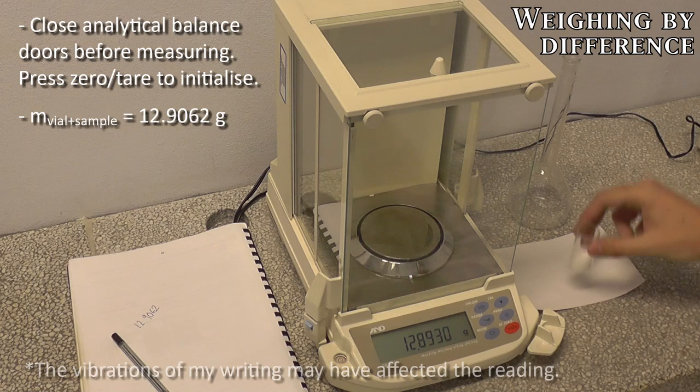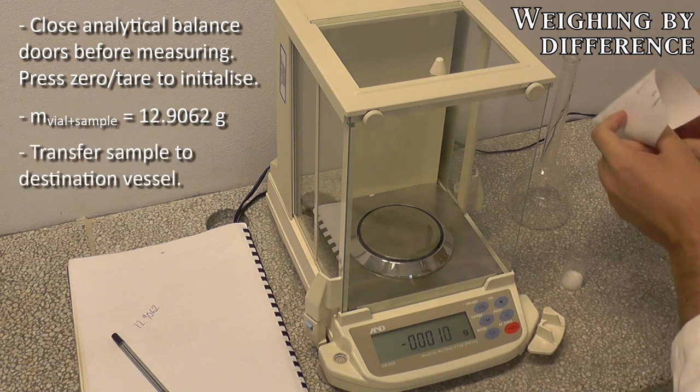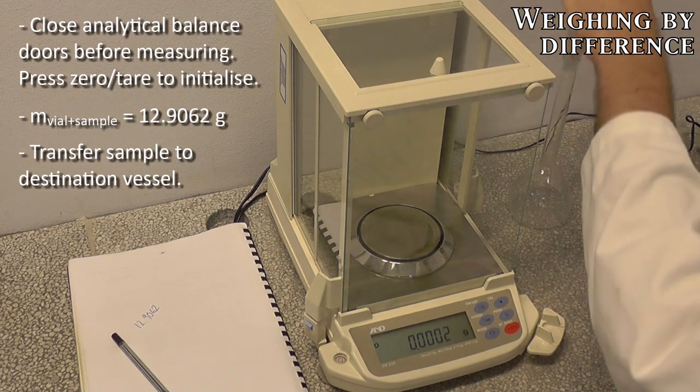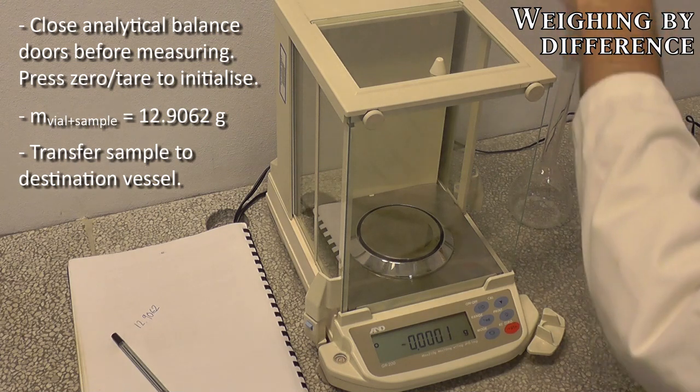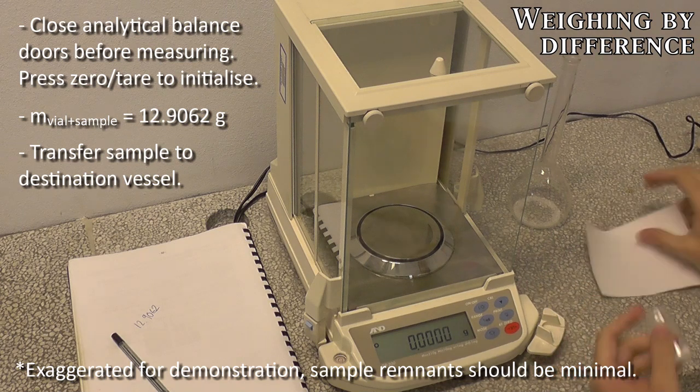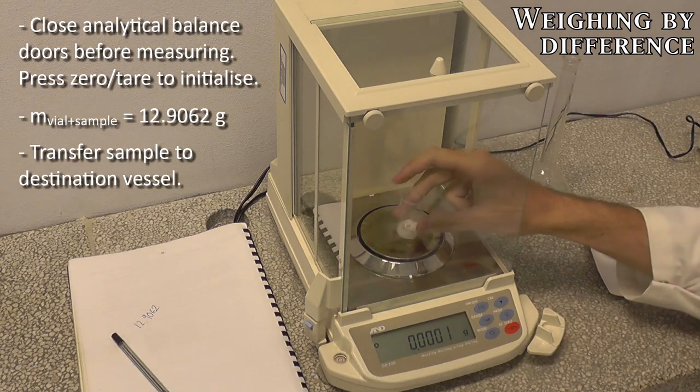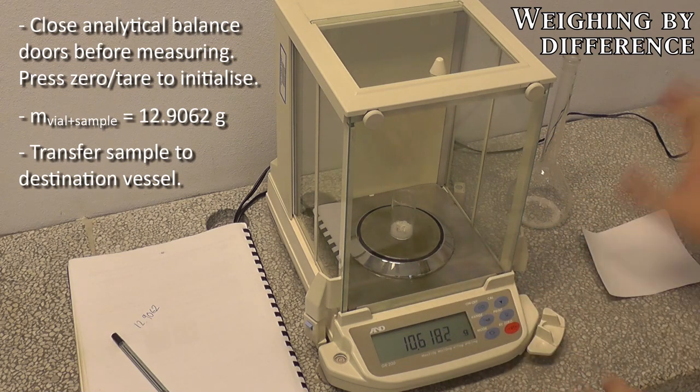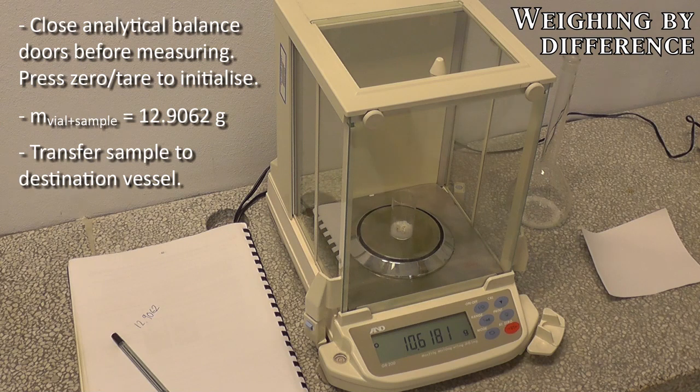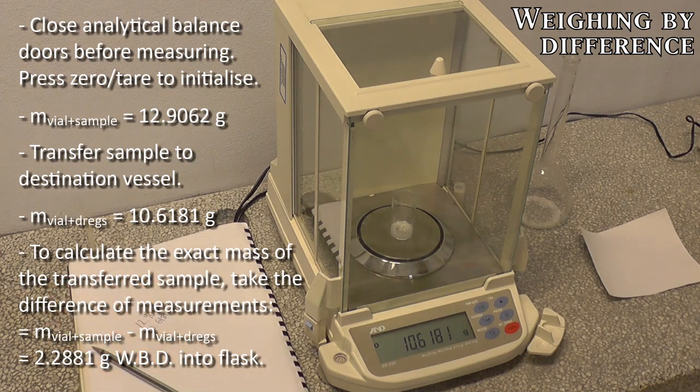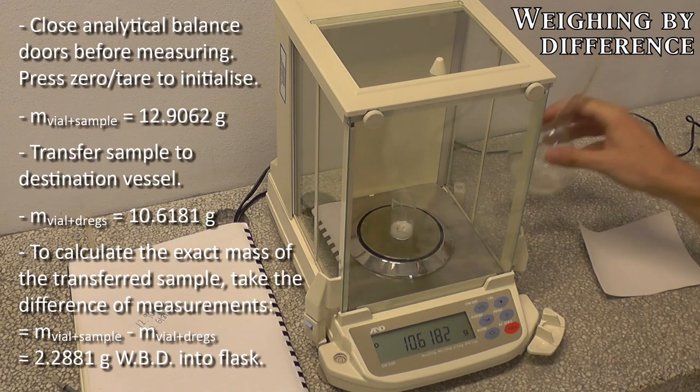Next what I'll do is I'll take my sample out, make a quick solids funnel, and transfer that solid into my destination vessel. You might notice that there is a significant amount of dregs left in here. So what I need to do now is to re-weigh the vial plus the remnants, those dregs, because those are not actually anything that I've transferred over to my reaction vessel. So re-weighing I get 10.6181 grams, and taking the difference of those two numbers will give me the exact quantity of solids I've transferred to my final reaction.